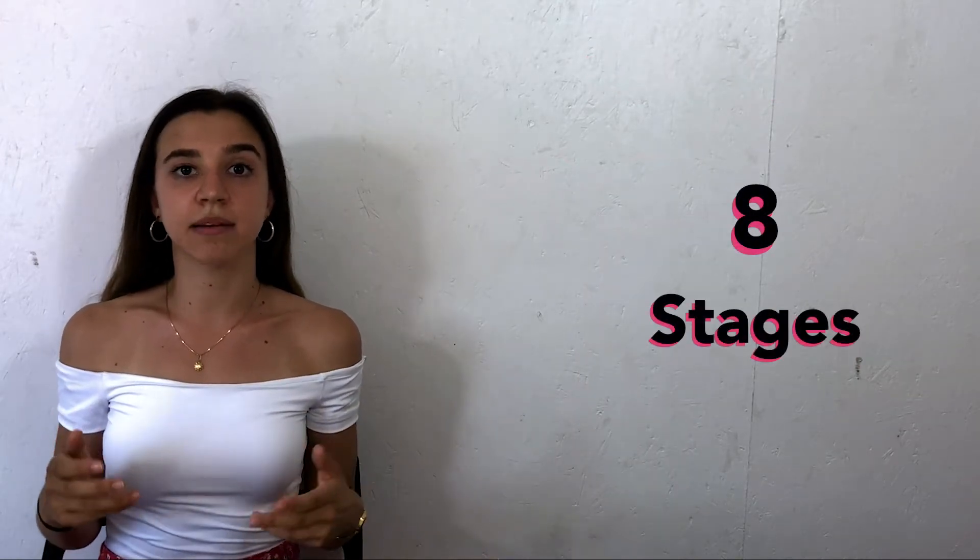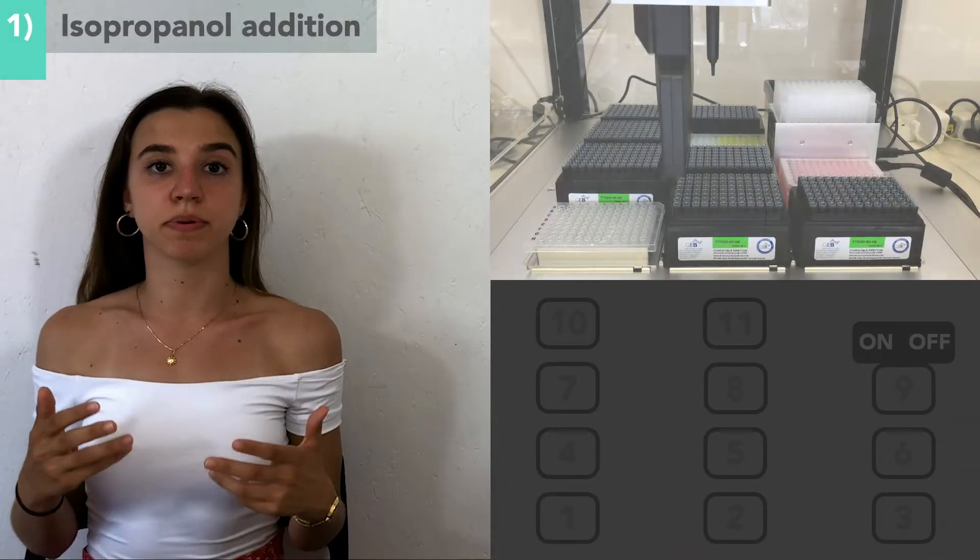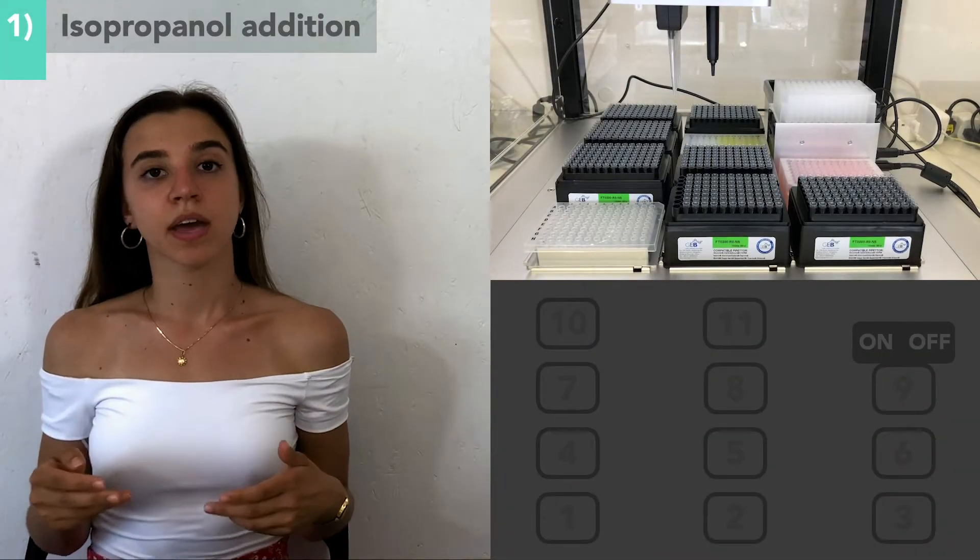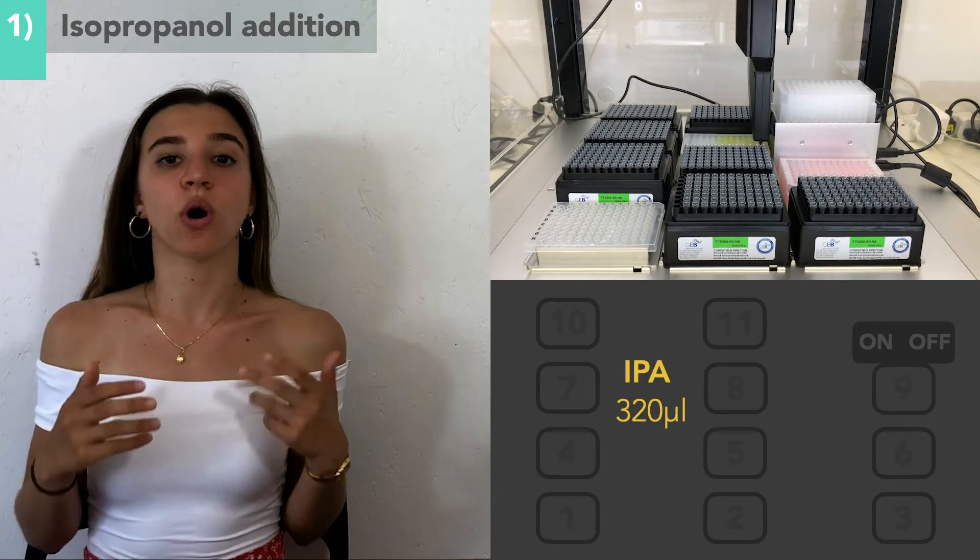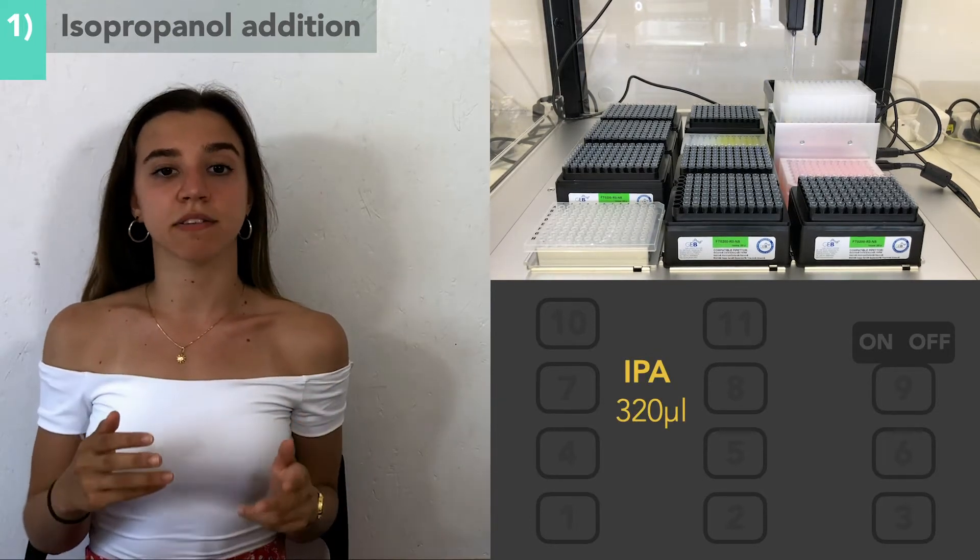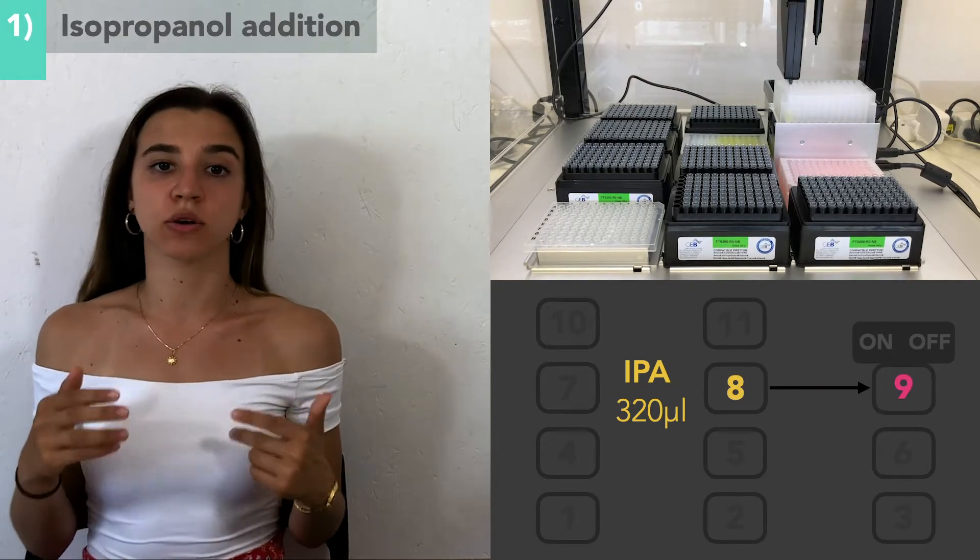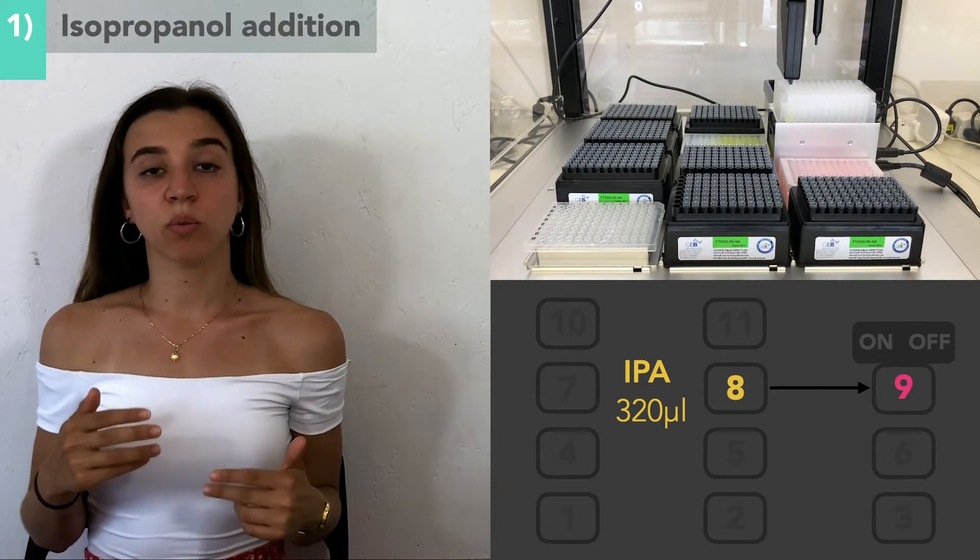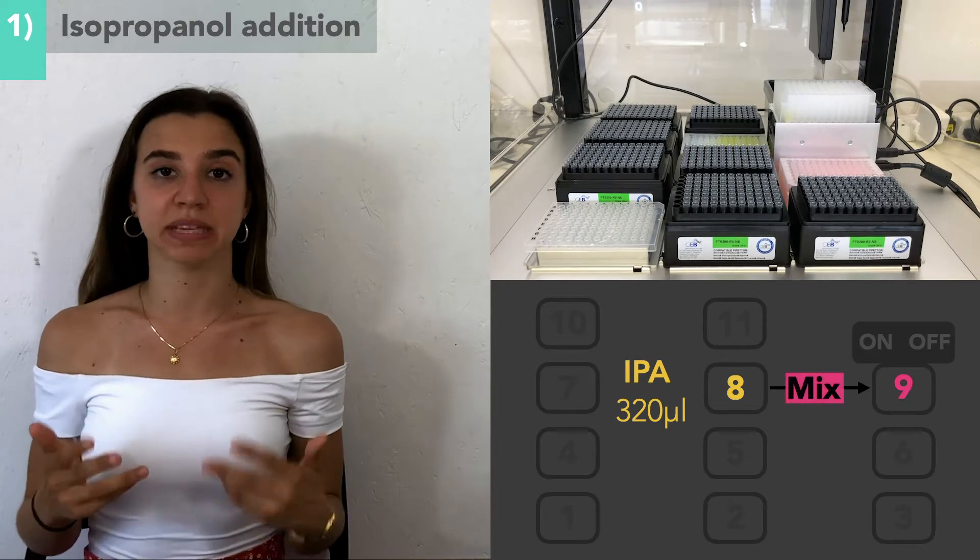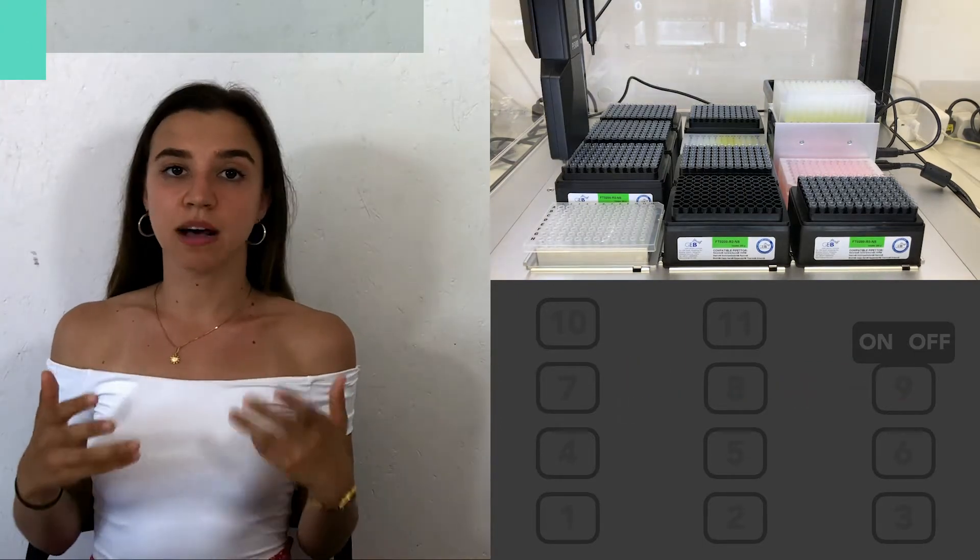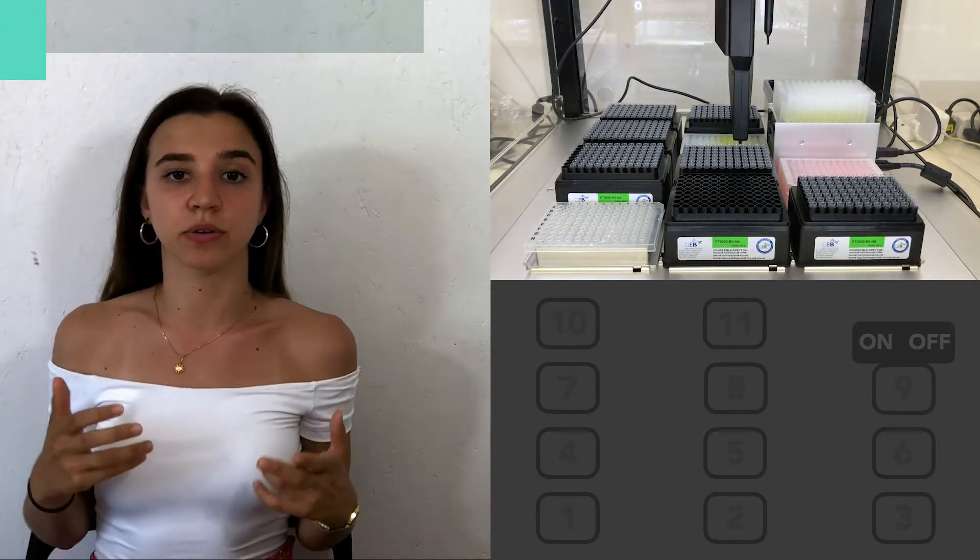This RNA extraction happens over eight stages undertaken by the OT2 robot. The first stage is the addition of isopropanol to the samples. 320 microliters of isopropanol will be taken from slot 8 and added to each sample well in slot 9. The sample will be pipetted up and down to mix properly.